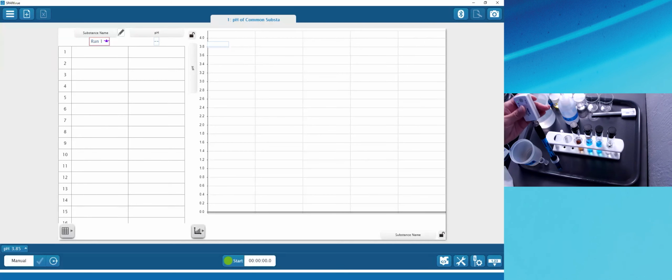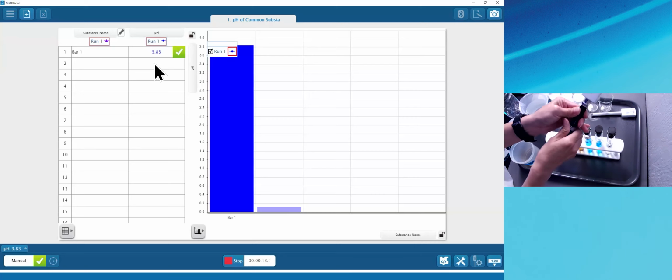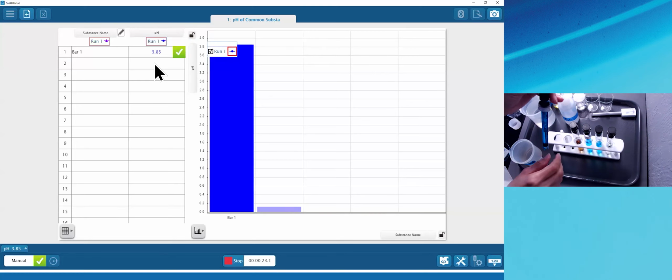So this is another manual sampling. I'm going to hit start. And using the pH sensor, since I'm using test tubes, I'm going to either want to roll this up the probe or take it off completely. I recommend rolling up the probe, and watch what I'm doing here. I'm not twisting anything. I'm pushing up only, because if I twist that, I might break the electronics. I want to avoid doing that.